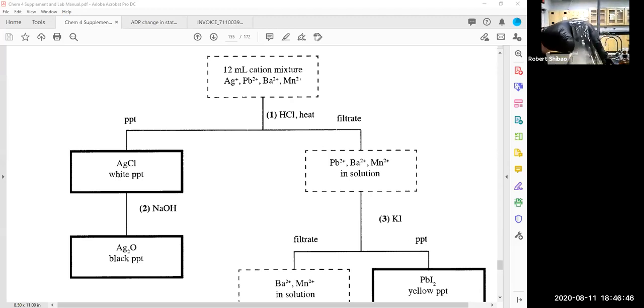All right, now the lead, I just have to make sure it was completely precipitated. It's hard to see if any more precipitates. We can try adding another drop of KI. Let me do that and see if it becomes more cloudy. So we have to look at it very carefully. I'm going to just drip it down the side, but still it's going to be hard to see if it becomes more cloudy. It's looking like it's not really becoming more cloudy, so I probably added enough KI.